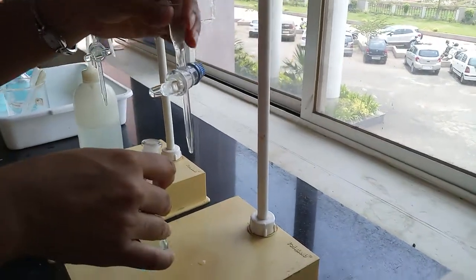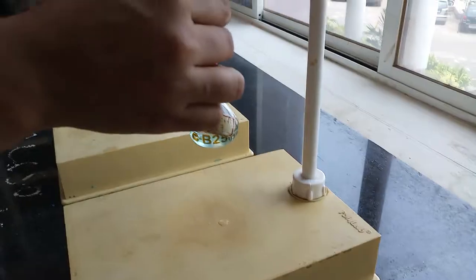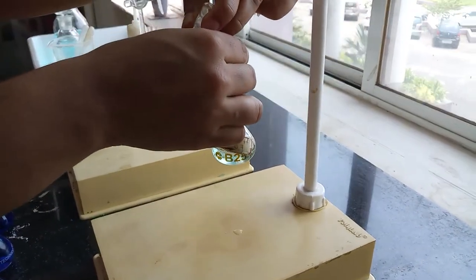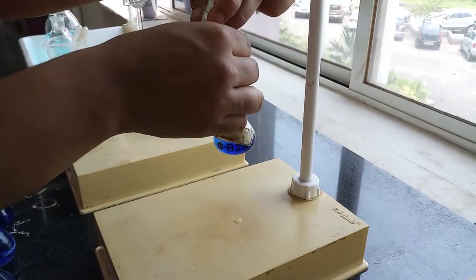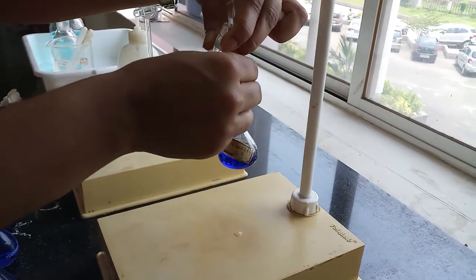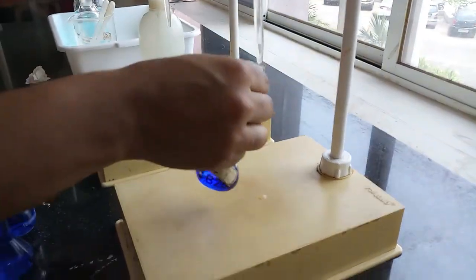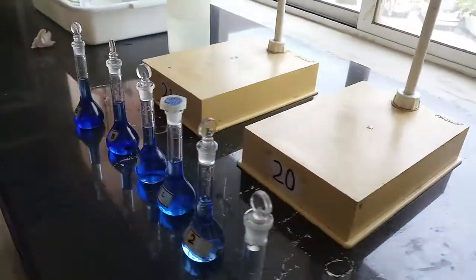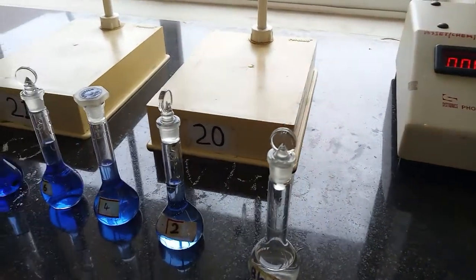Meanwhile, an unknown volume of copper sulfate is given in a standard flask. For that also, we have to add 5 ml of ammonium hydroxide, then make up to the mark by adding distilled water and keep it ready. The volume of copper sulfate in this flask is not known — that you have to get from the graph.